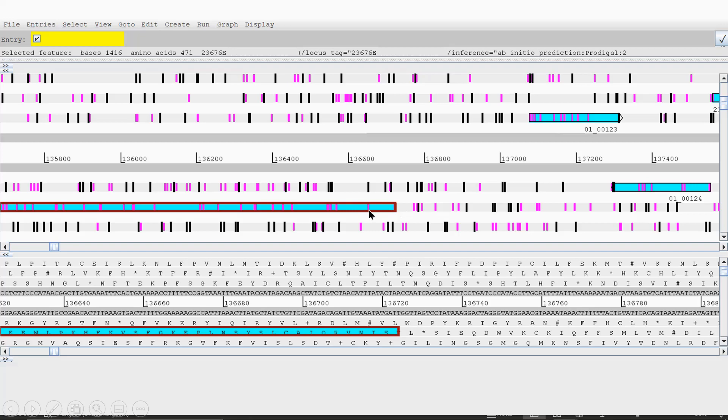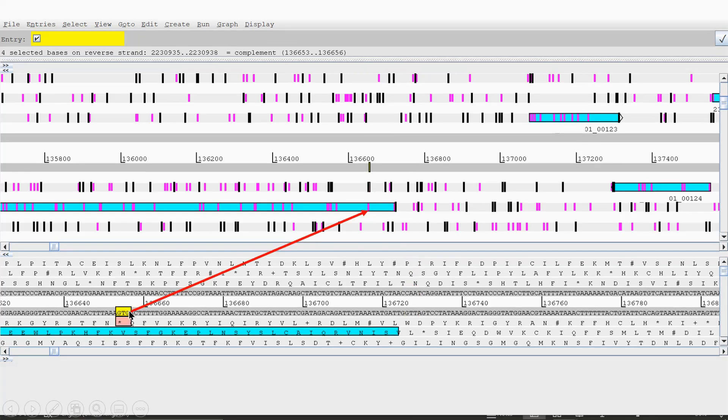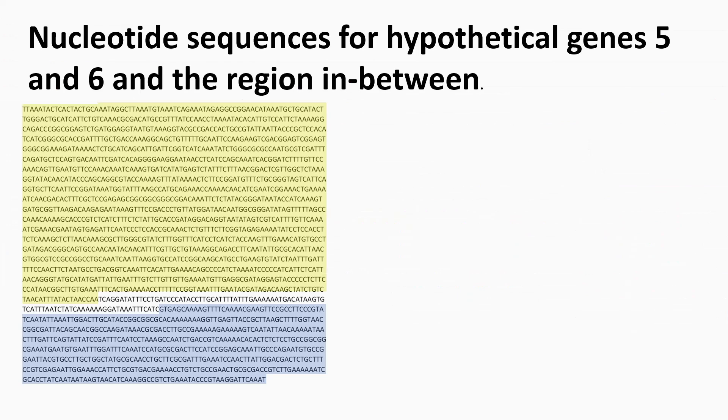Okay, there's another potential start codon, which is here. So as I've shown there, TTG. But here is GTG. So the next one along is actually a GTG. So hopefully that'll make more sense in a minute.